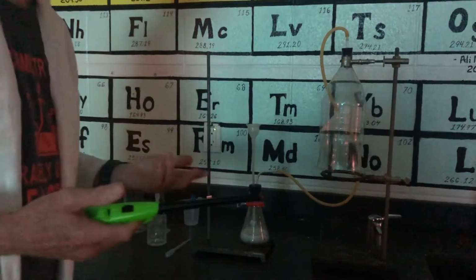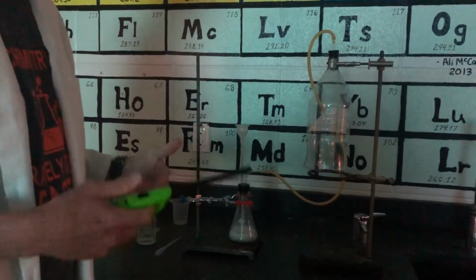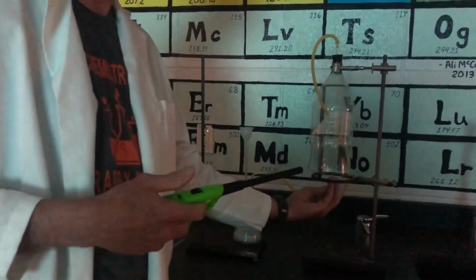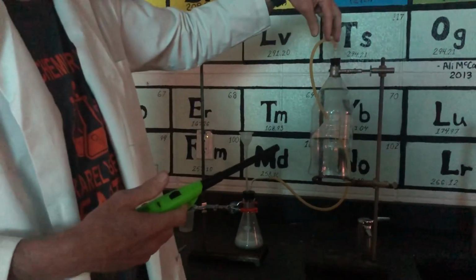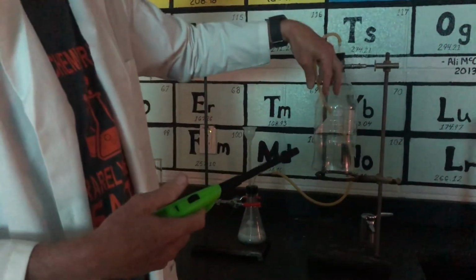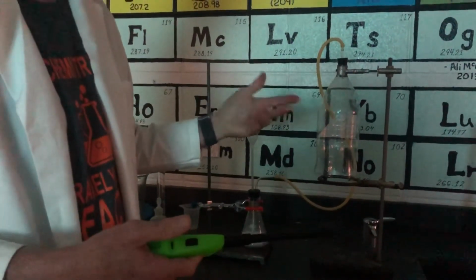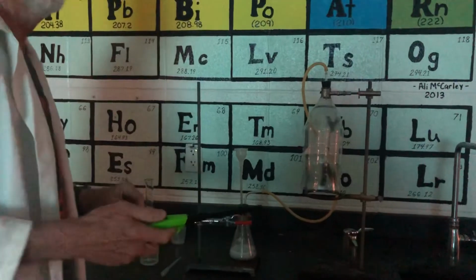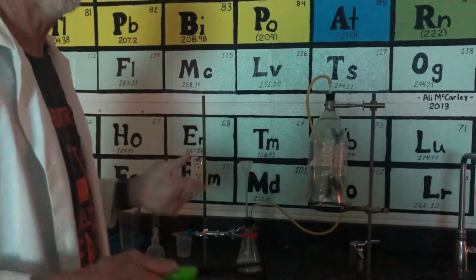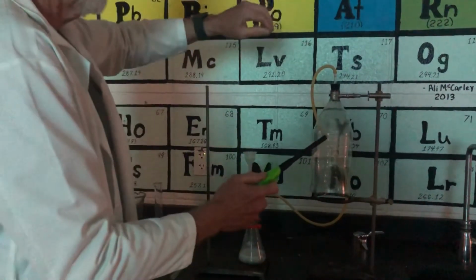But the reaction could be very quick, or it could take a few moments for the oxygen to come in and reach up here to the point that it will actually backfire down into this chamber. If it does, there will be a fairly loud explosion inside this chamber. I don't usually tell my students that. I just kind of let them experience it. But here we go.